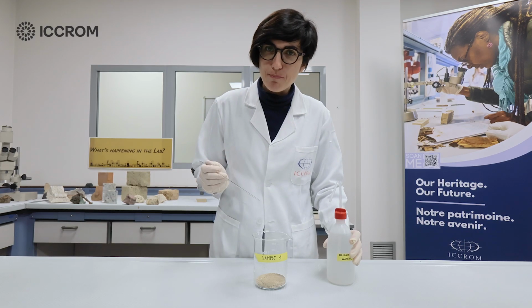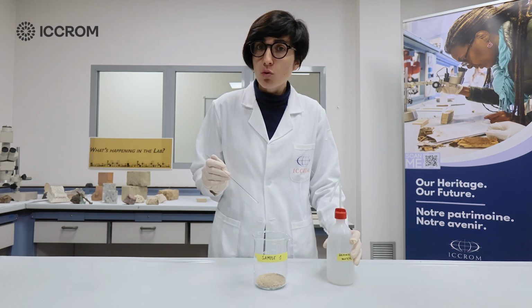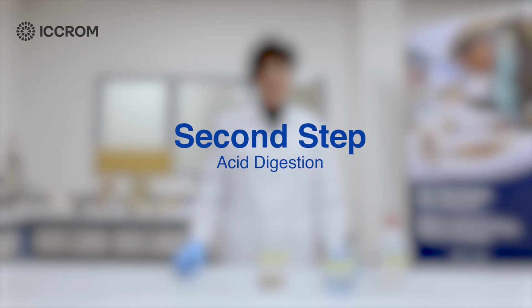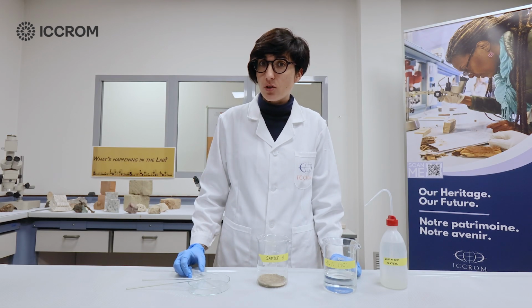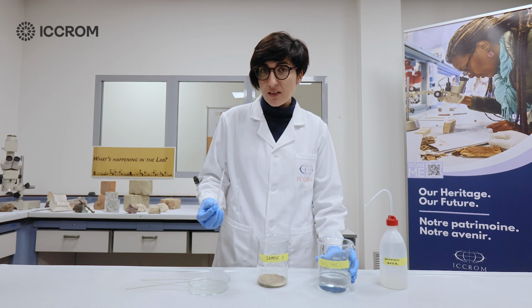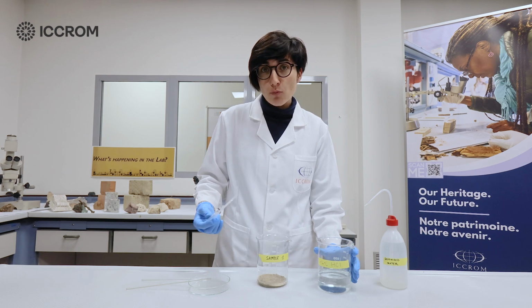After you weigh your sample, before proceeding with the acid digestion, make sure to moisten and dampen your mortar sample with just a small quantity of water. We're now going to start the second phase of the test, which includes the acid digestion that allows us to dissolve our binder. Start by adding a few drops using a plastic pipette to record the reaction with your mortar.